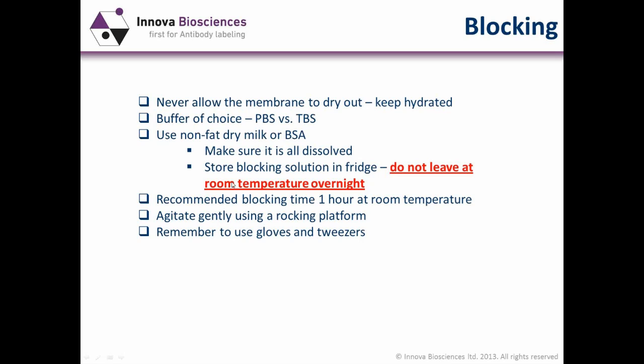Sometimes people probe their membranes overnight at 4 degrees C, which makes sense. You don't want your milk going off. But what I could never understand is that the same individuals would store their blocking solution at room temperature. I used to do my Western blots in San Francisco, where room temperature could vary from 20 degrees during the day to 27 or 28 degrees in the summer.